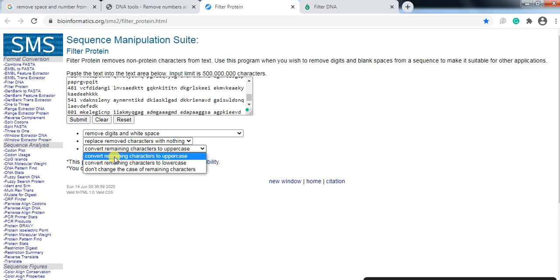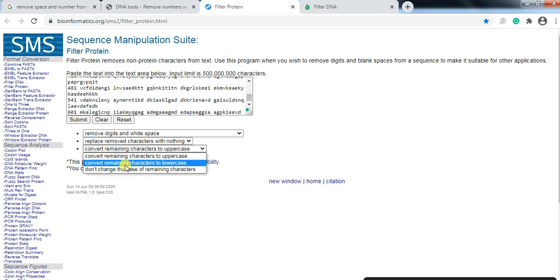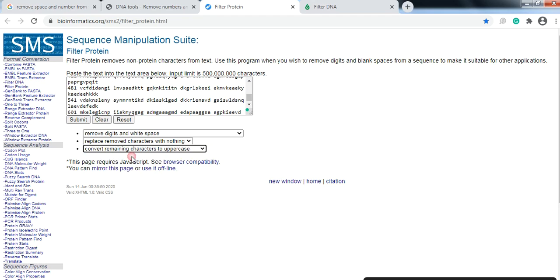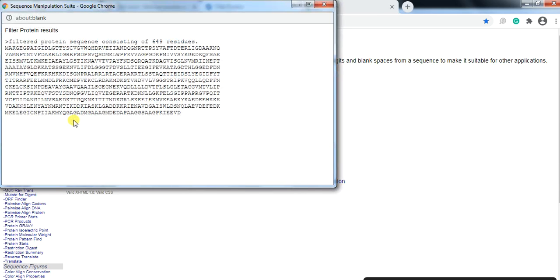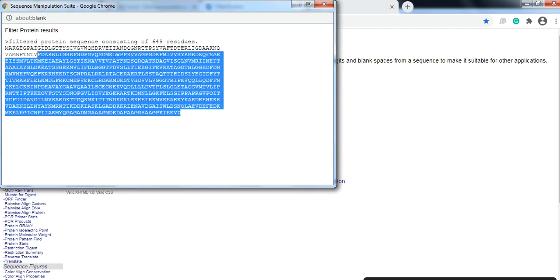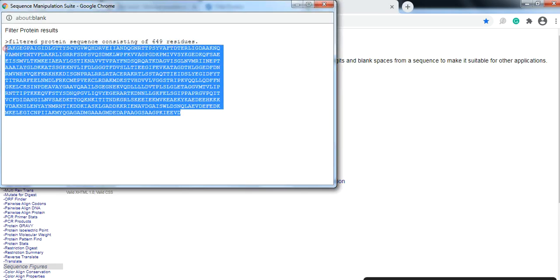And here also the sequence that doesn't have the space and that number converts remaining factors to uppercase or lowercase or you don't want to change any. We need the uppercase so you select it and here you can press submit. So you will get that space removed and also doesn't have the number and in uppercase, so you can copy it and use it into your document.